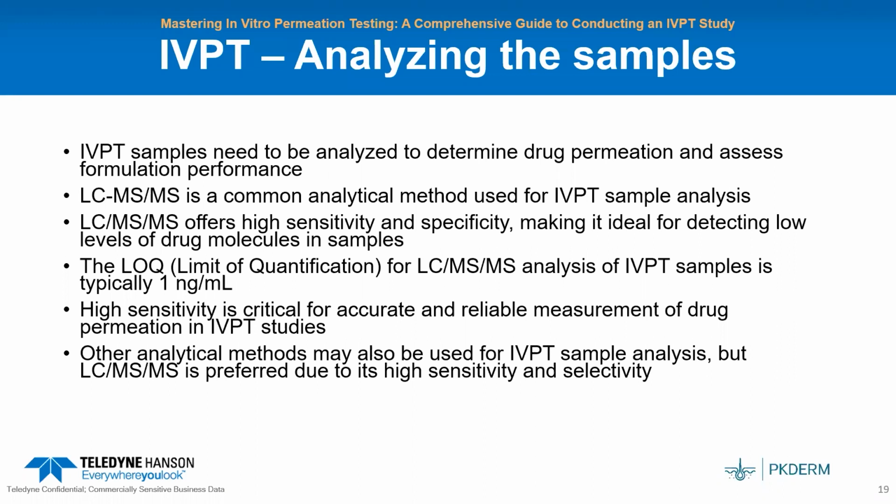Other analytical methods may also be used for IVPT sample analysis, but LC-MS-MS is often preferred due to its high sensitivity and selectivity.